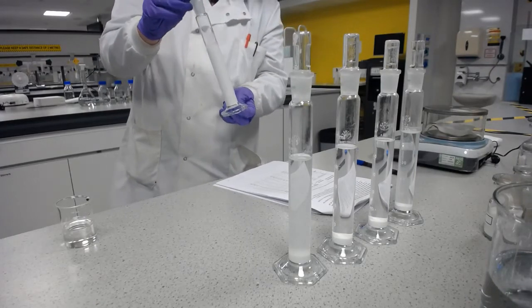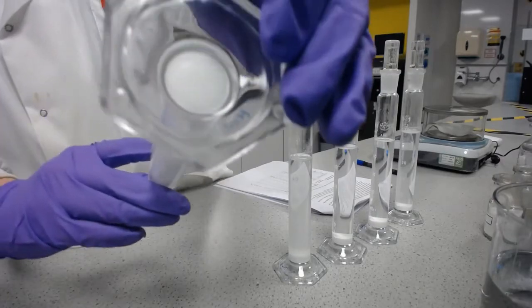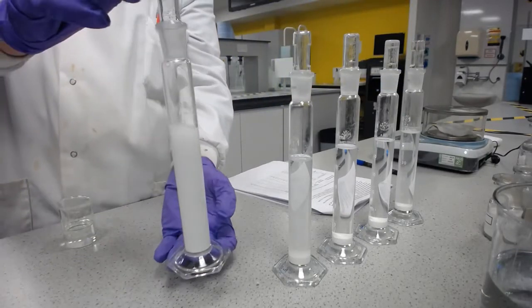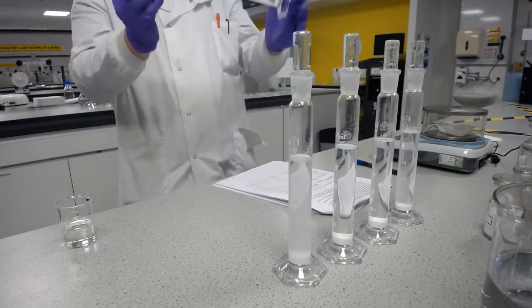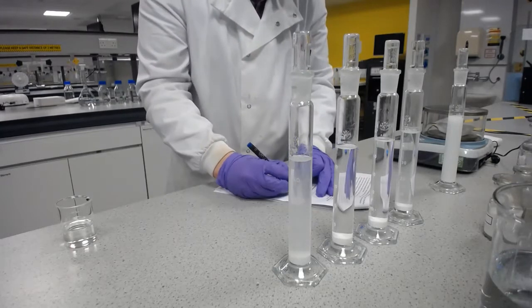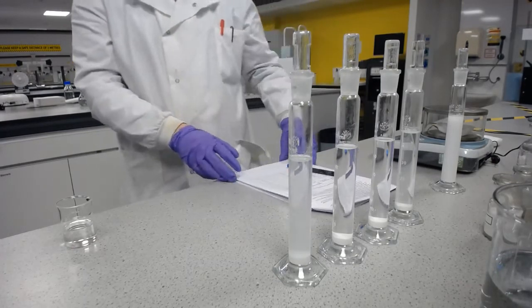Okay, I've done 30 inversions, and we can still see that there's an awful lot of the powder at the bottom there. We do have some up here, but we've no idea of the concentration. So that's no good. So water on its own, no good. So the number of inversions required were over 30. I'm not going to carry on any longer with that.